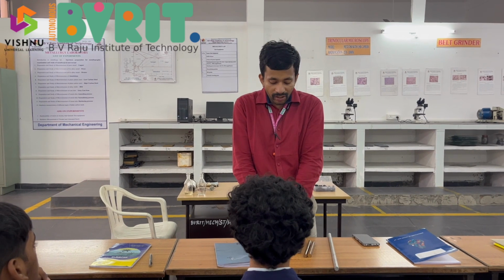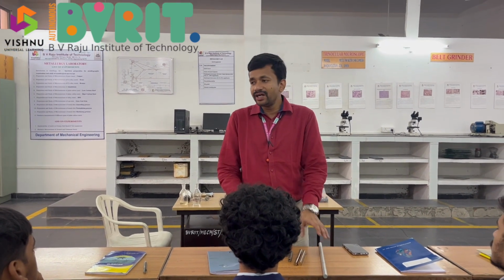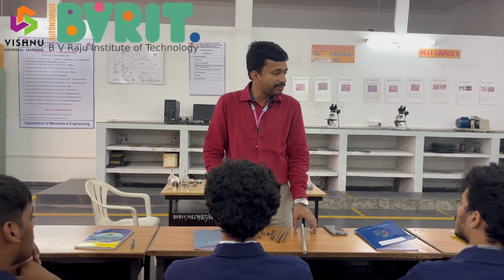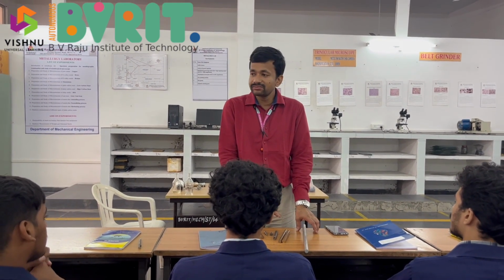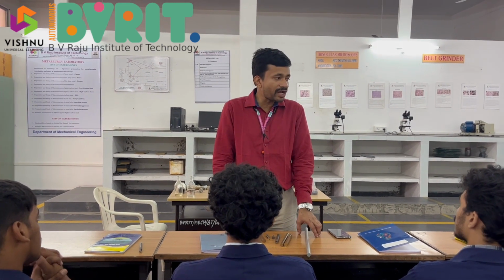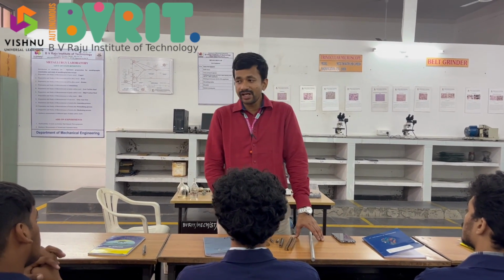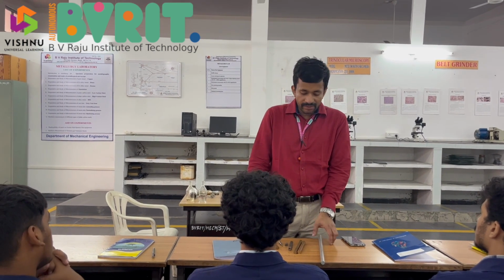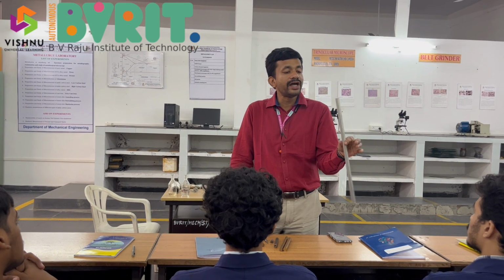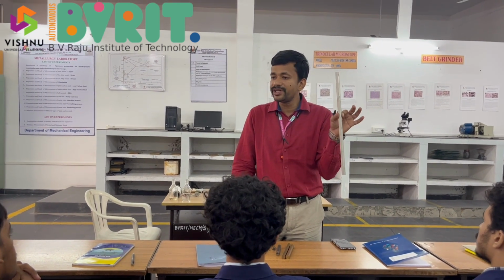All right, so it is very difficult to identify which is which metal by looking at its color and maybe to some extent the structure. That's not how an engineer will do it. Of course, by looking at the weight and the appearance, we can easily make out aluminium.